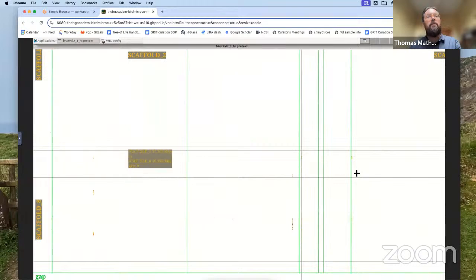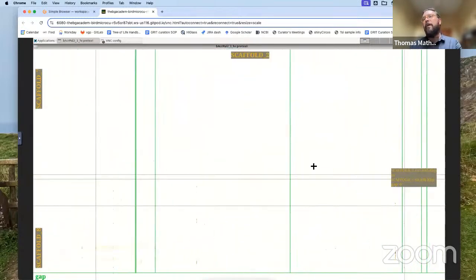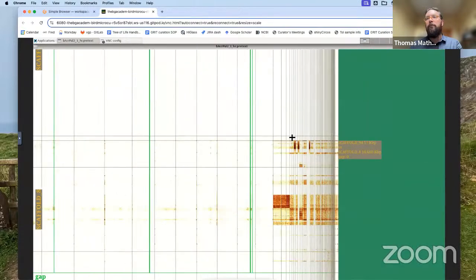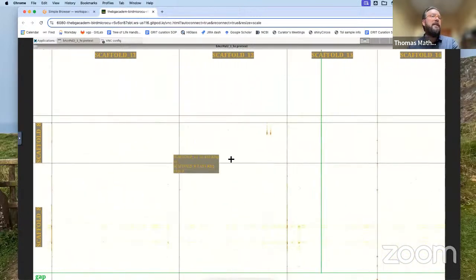I'm looking off the diagonal here. It doesn't belong with any other chromosome. If I go the other direction, check the other direction. And it's not hitting much of the shrapnel, and it's not hitting any other chromosome. So this is really classically looking like a single small chromosome on its own, very dense Hi-C contacts on the diagonal, and it doesn't belong with anything else.